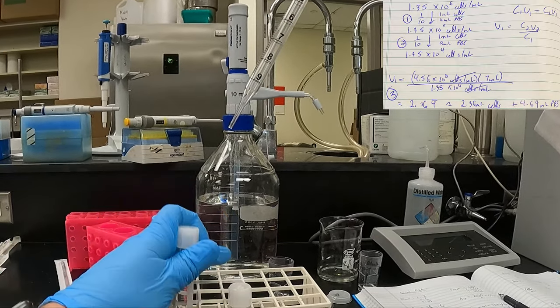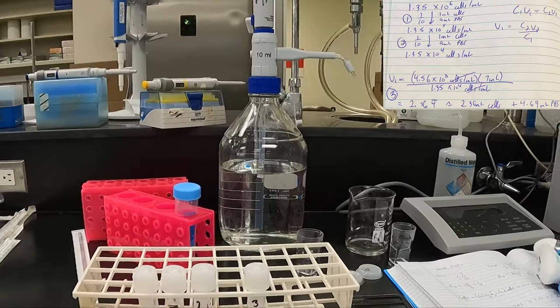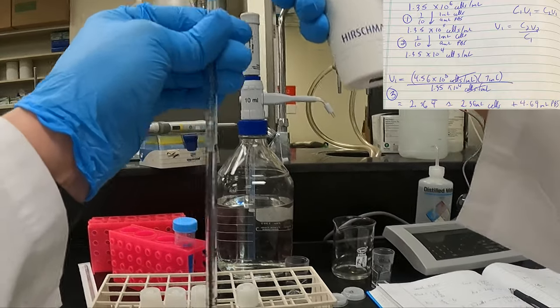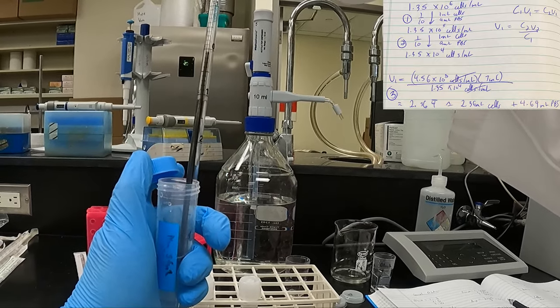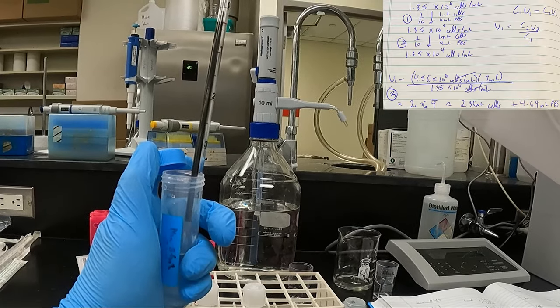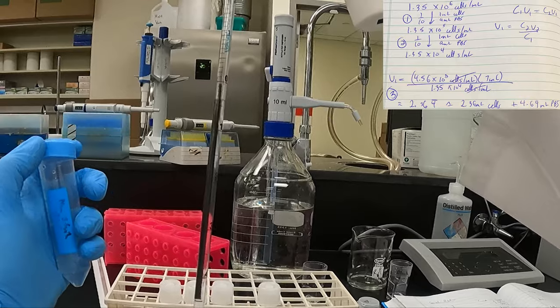For tube number 3, I'm going to load in 4.64 mils of PBS. To do that, I'm going to use a smaller pipette, a 5 mil pipette. The 4 and the 6, no problem getting that. The last 4 will be some guesswork. So 4.6 and somewhere between the 6 and the 7 there.